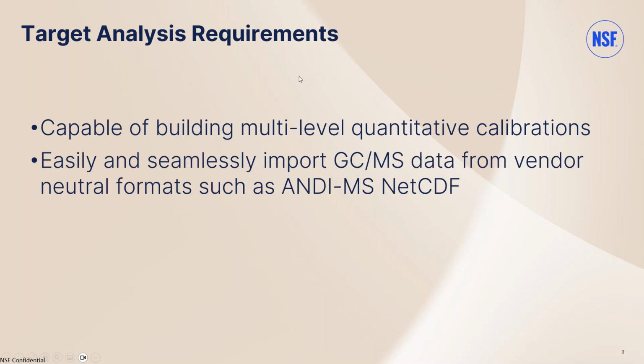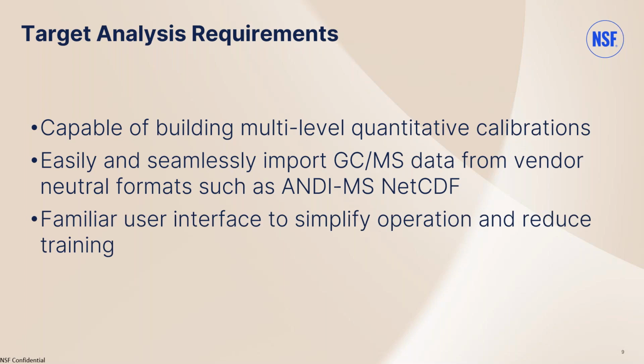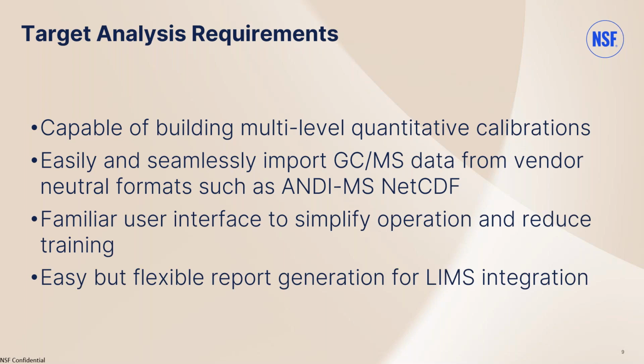Pretty standard CDS requirements, but we also wanted it to work with vendor neutral formats or open source formats like ANDI rather than just proprietary data formats. We wanted it to be familiar and easy to train people on. And also we want something that can integrate with our LIMS system seamlessly without a lot of manual tasks involved.